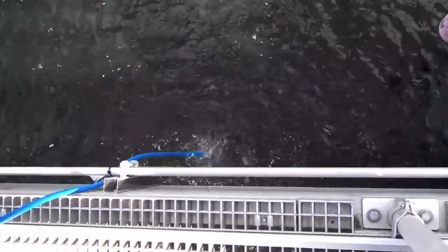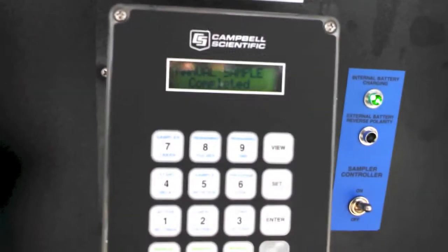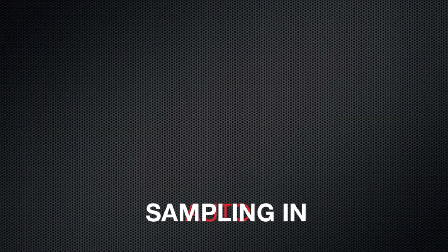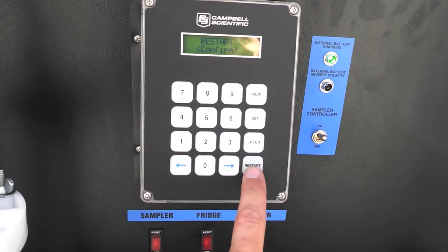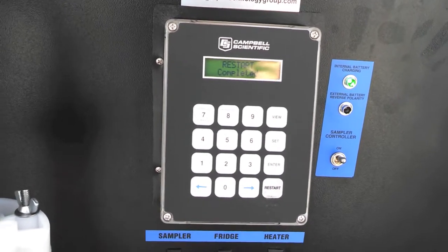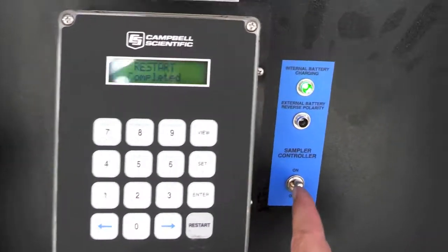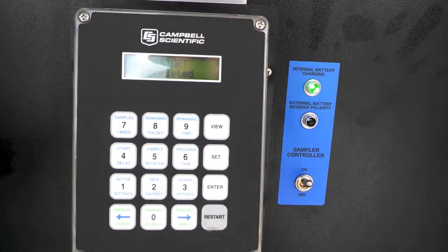This purge time is going to be set to whatever we want, and we're done. The manual sample is showing completed. We're going to go ahead and restart our sample program, and it now shows the restart is complete. The sampler is on and showing the internal battery is charging — this unit does have the battery backup.